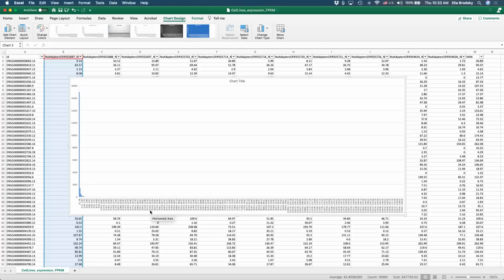So the mean is going to be very low, and you can see here the bins that I have are between 0 and 39. That includes the majority. Point 1 includes 17,000, right? So this means that point 2, which is between 117 and 156, right?